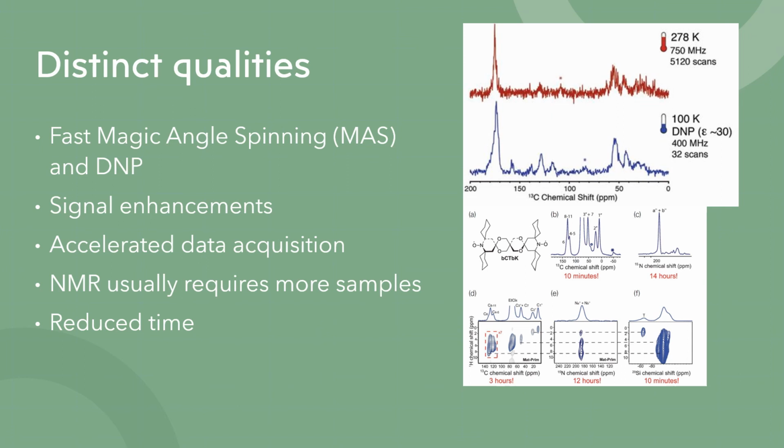Now, DNP NMR acquires data at a much faster rate compared to standard NMR. This is extremely useful for solid state of pharmaceuticals, from the drug delivery up to the formulation development, and it's very useful in small organic molecules to be able to attain accurate NMR data.